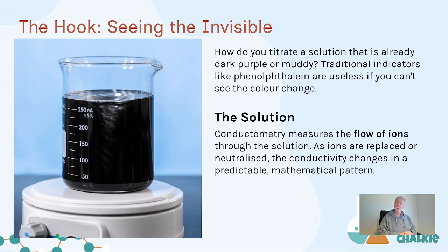Imagine doing that in that beaker there. Not going to see a pink coloration, are we? In fact, you can't see anything in a beaker with that kind of cloudiness, if that's putting it very mildly. So if you are doing a titration where the solution is cloudy or very, very cloudy like this one is, then you can't use a normal acid-base titration because indicators won't work.